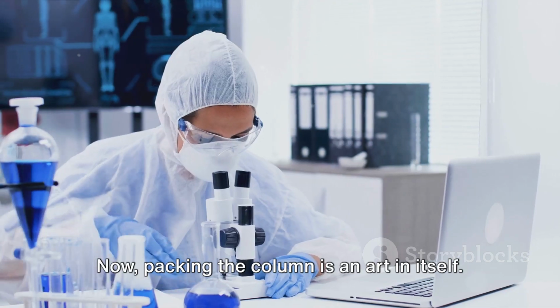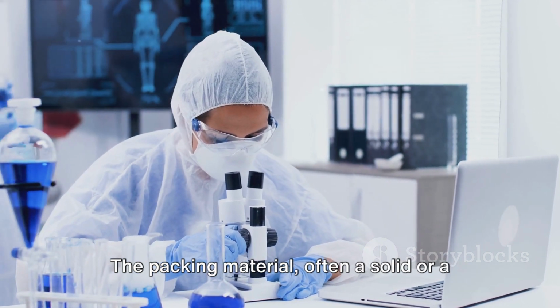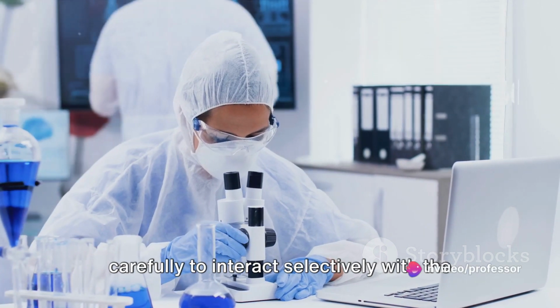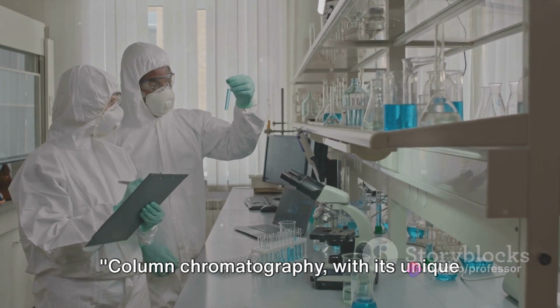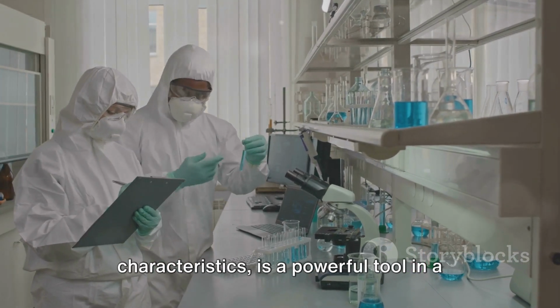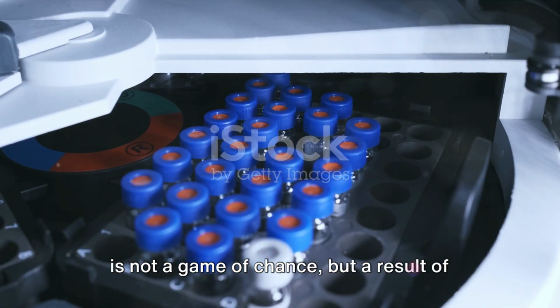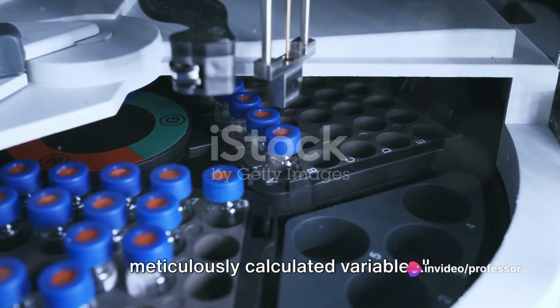Now, packing the column is an art in itself. The packing material, often a solid or a liquid on a solid support, is chosen carefully to interact selectively with the mixture's components. Column chromatography, with its unique characteristics, is a powerful tool in a chemist's arsenal. The efficiency of column chromatography is not a game of chance, but a result of meticulously calculated variables.